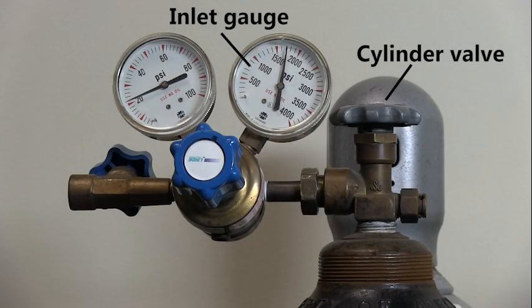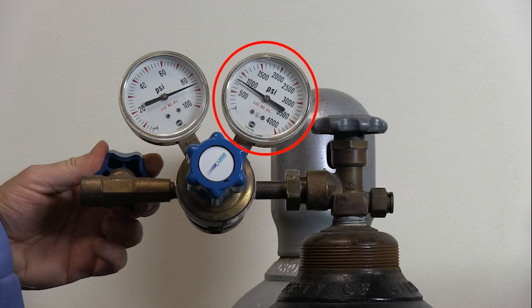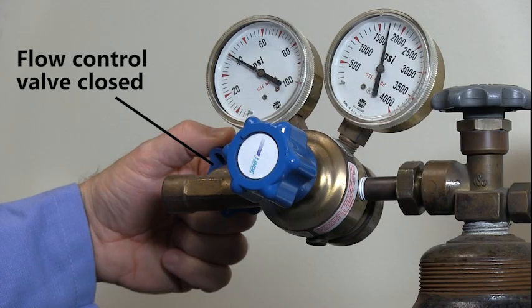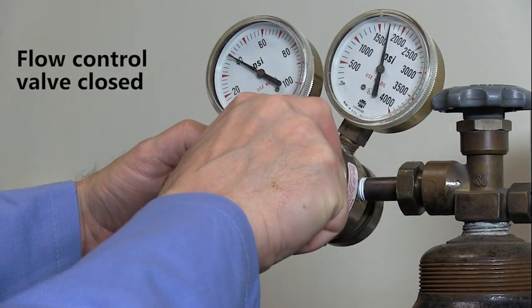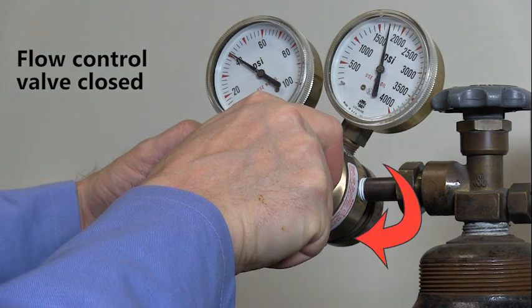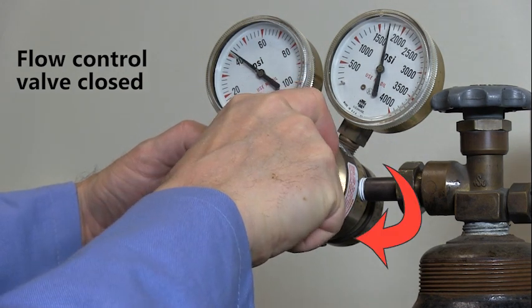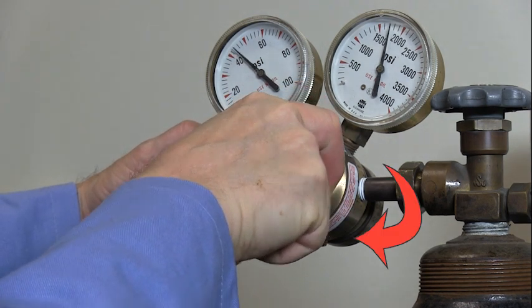Open the cylinder valve slowly until the inlet gauge on the regulator registers the cylinder pressure. If the cylinder pressure reading is lower than expected, the cylinder valve may be leaking. With the flow control valve at the regulator outlet closed, turn the pressure-adjusting screw clockwise until the required delivery pressure is reached.